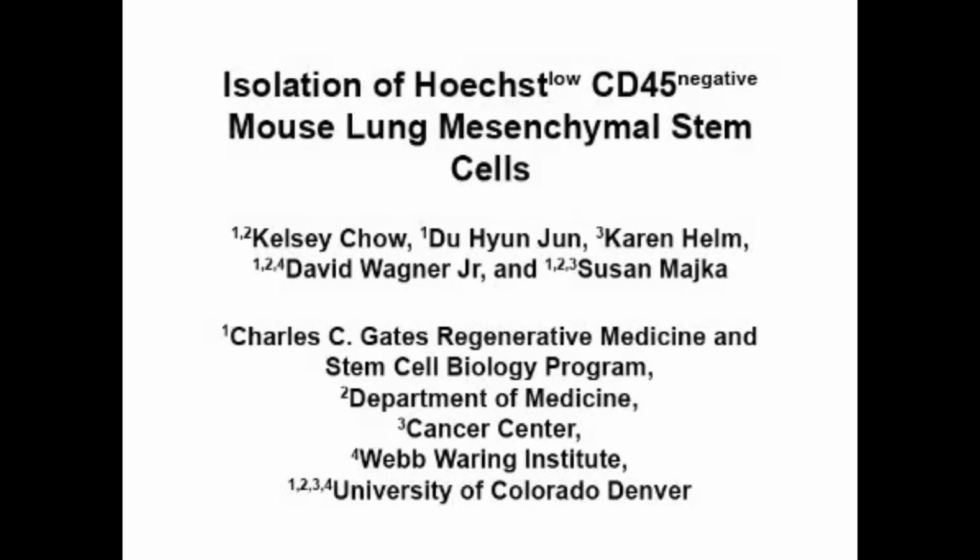This video demonstrates a protocol for the isolation of Hoechst low CD45-negative lung mesenchymal stem cells. Tissue-resident mesenchymal stem cells, or MSCs, are important regulators of tissue repair or regeneration, fibrosis, inflammation, and angiogenesis.